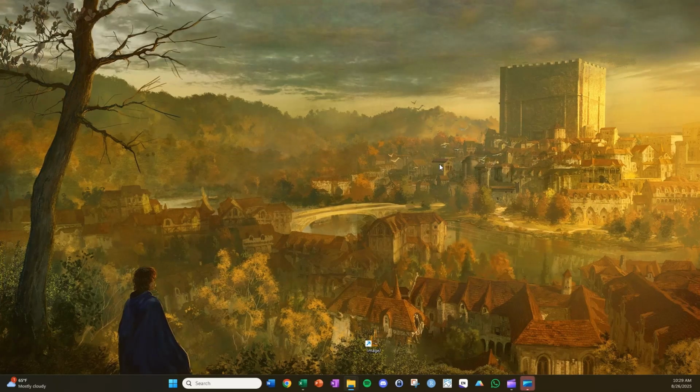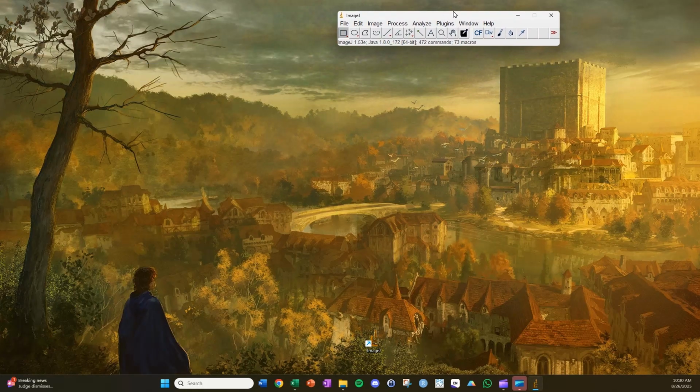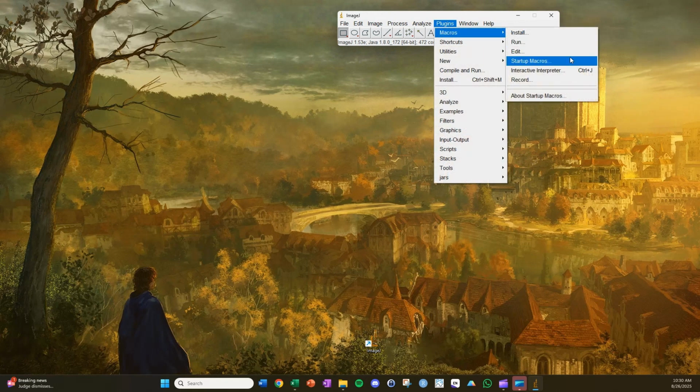All right, this is a video giving part 1 of 2 of my contractility analysis in tissue. And this part will focus on the MYOCYTER aspect of getting the contractility data. So there are 2 things you need, MYOCYTER and ImageJ. And so you'll need ImageJ downloaded, and also you'll need the MYOCYTER file able to be installed.